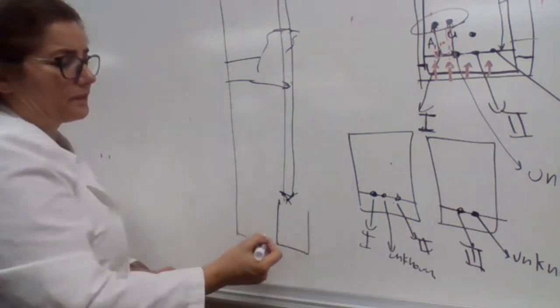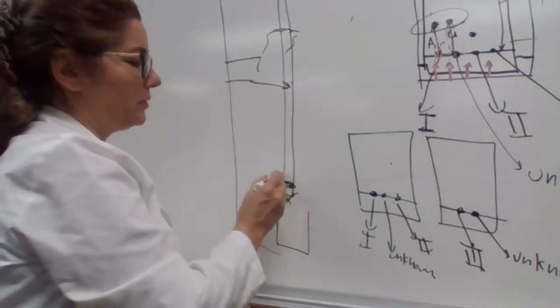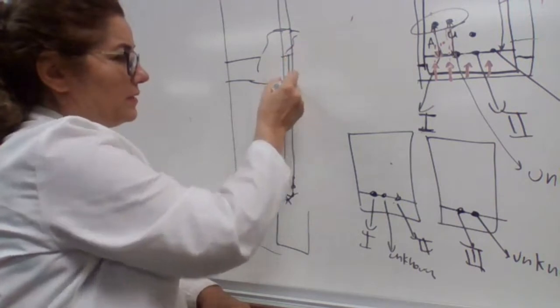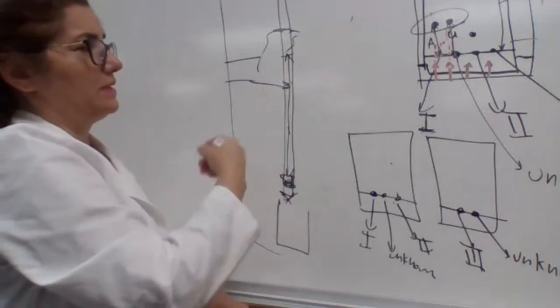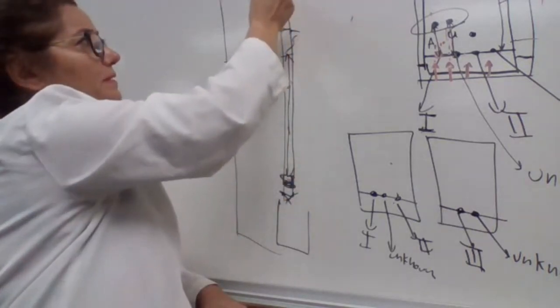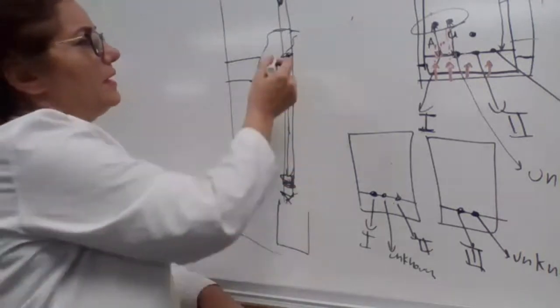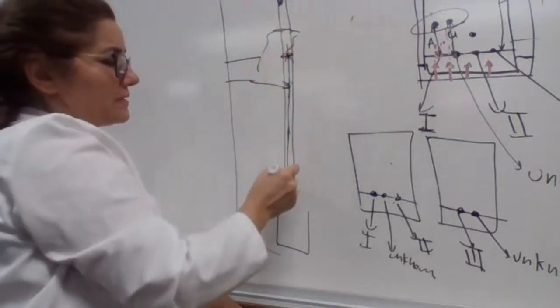There is a procedure for how to prepare the column. So you are going to use the cotton ball, then sand or glass wool, or sand again, and then you fill this up with the stationary phase, which again is alumina. Alumina is polar. Then you bring your sample, the mixture of the two samples that you have, prepared following the procedure, and use solvent constantly to elute this.